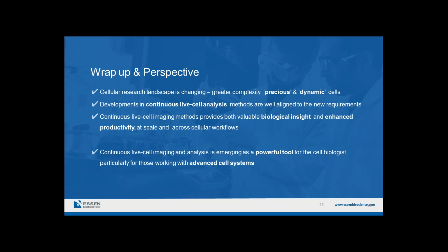My concluding statement is that continuous live cell imaging and analysis is strongly emerging as a powerful tool for the cell biologist, particularly for those of you that are working with or considering working with more advanced cell systems. So on that note, I will finish up. I'll hand back to Tim, who will facilitate the question and answer session.